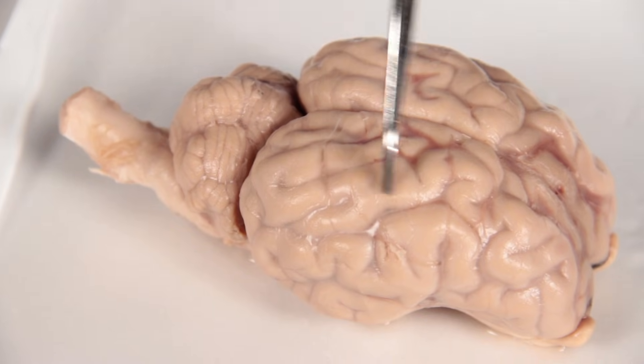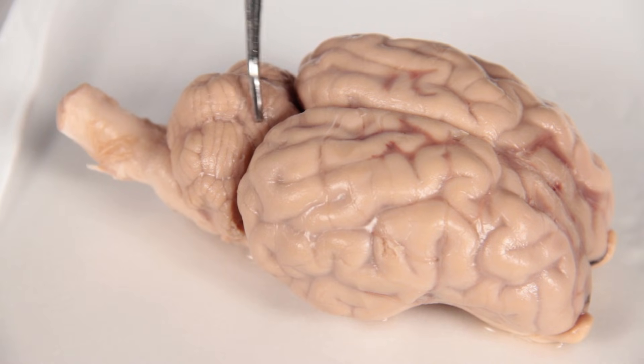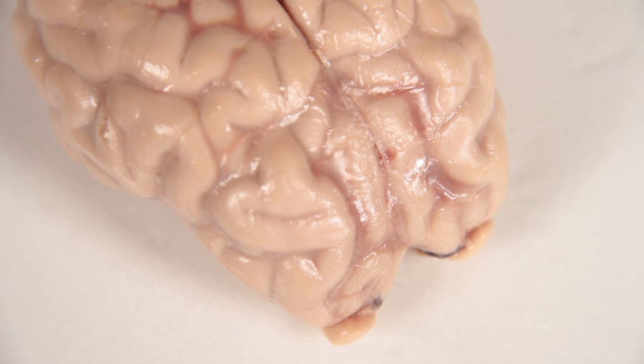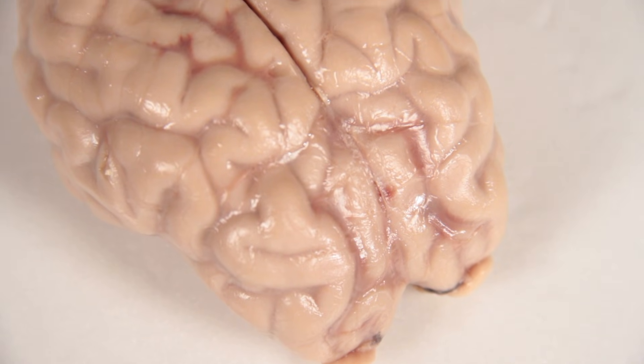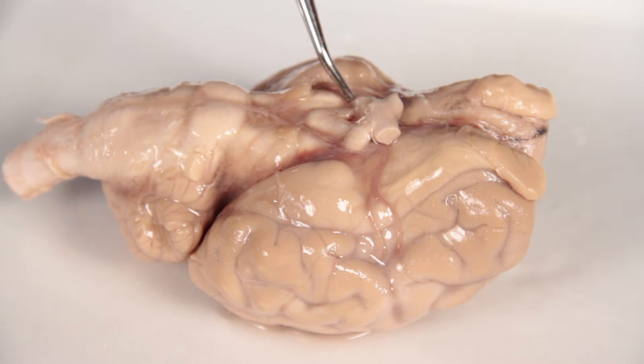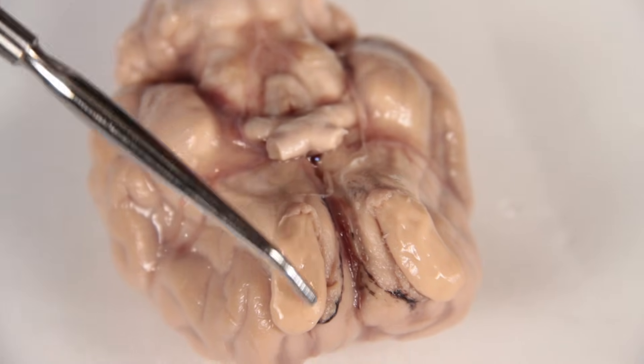Place the Sheep Brain in the dissecting tray, dorsal surface up. Observe and identify the following parts of the brain: cerebrum, cerebellum, spinal cord, medial longitudinal fissure, right and left hemispheres, olfactory bulb, and optic nerve.